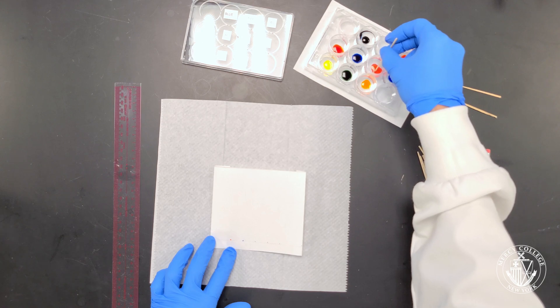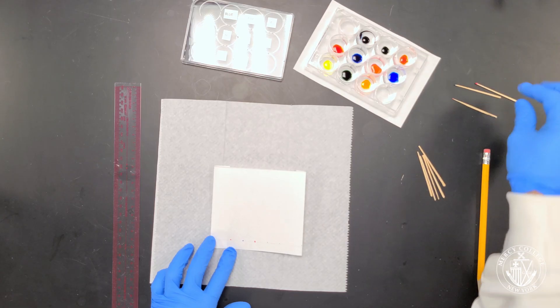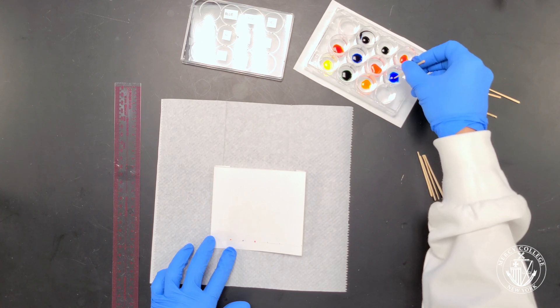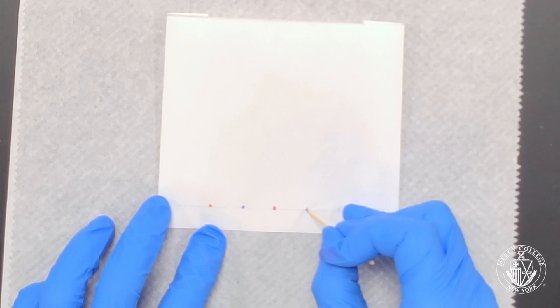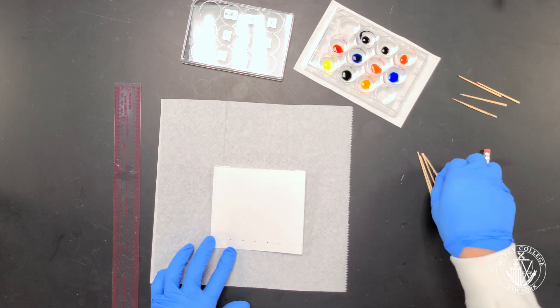However, for some of the lighter colors like the yellows or the oranges, you may want to spot twice to make sure that you get enough dye on your chromatogram so that you can see the spot when it develops. Also make sure that you're using gloves when handling your chromatography paper to avoid any contamination. Be careful to use a clean toothpick for each sample because you don't want to cross-contaminate your dyes.